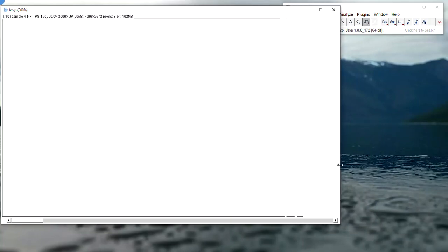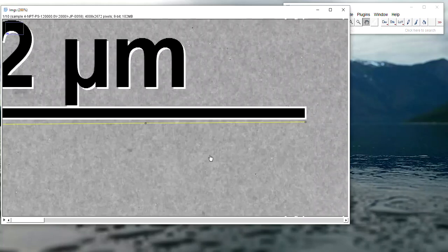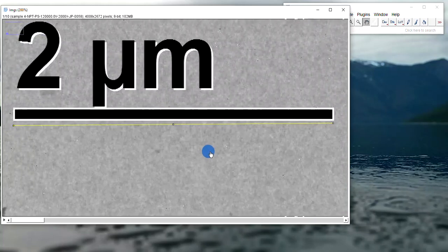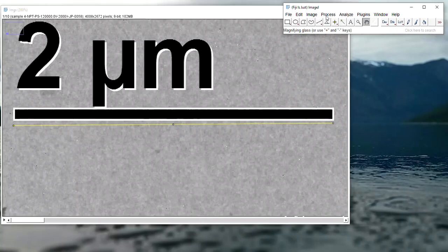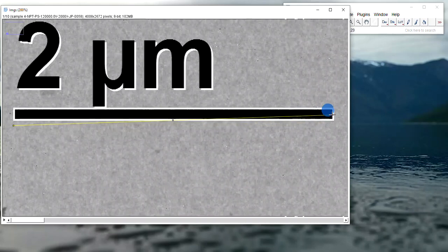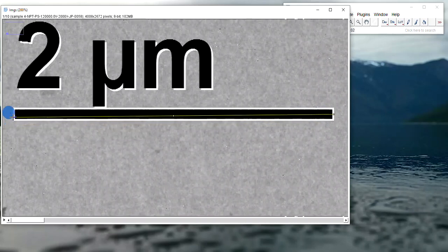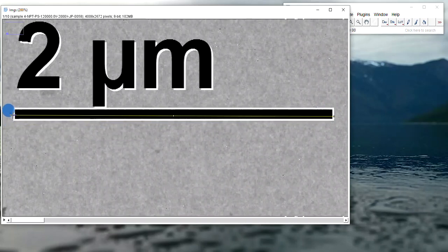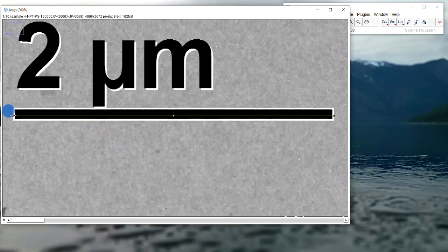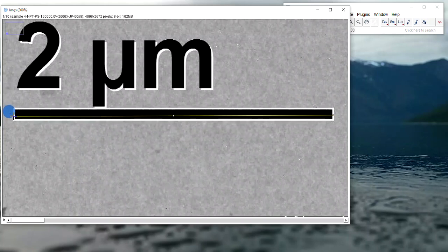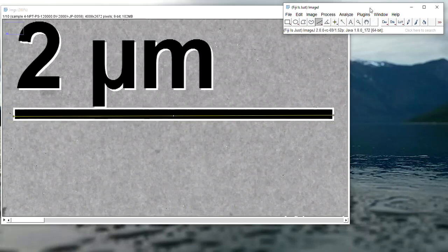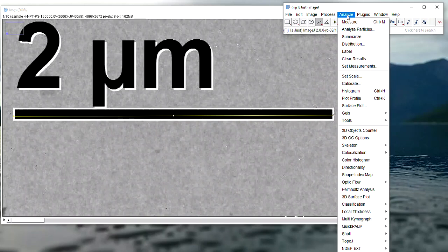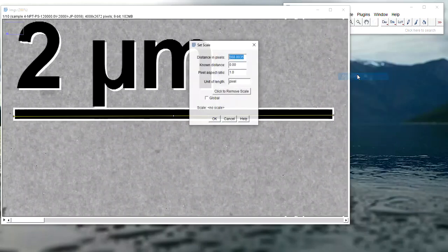I like to zoom in on the scale bar to make sure it's as accurate as possible. I did a pretty good job without zooming. This line will be used to set the scale bar by going to Analyze and Set Scale.